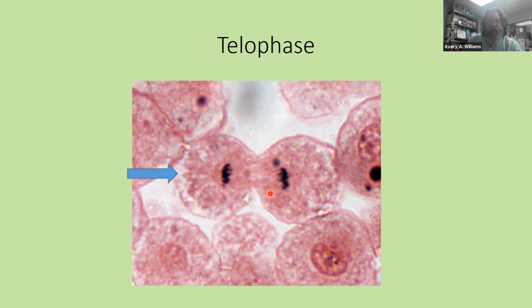So this is telophase. And you could have early, middle, and late telophase based on how deep that cleavage furrow is. If it's just a little bit, early telophase, a little bit more, middle telophase. And if it's almost all the way connected or all the way separated, say late telophase. But if you can see a little connection between them, it still would be telophase. So what is this? Is this early, middle, or late? Mid to late, because it's almost completely through, but it's definitely telophase. Okay, that's how you recognize telophase.